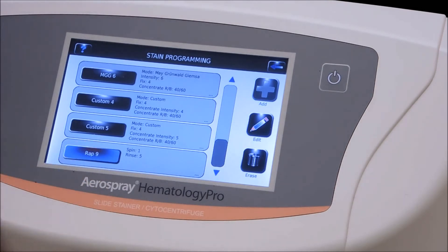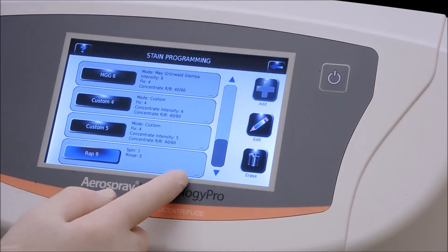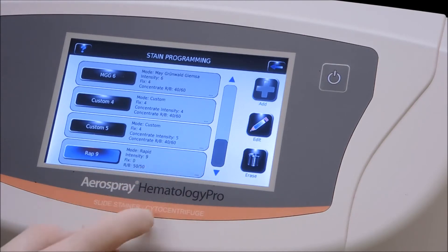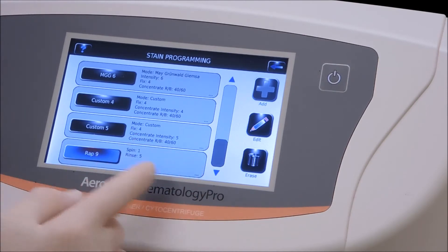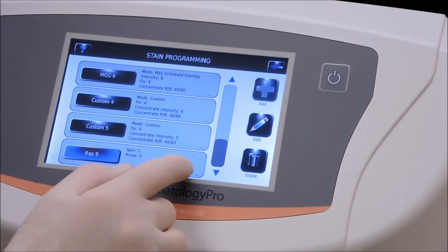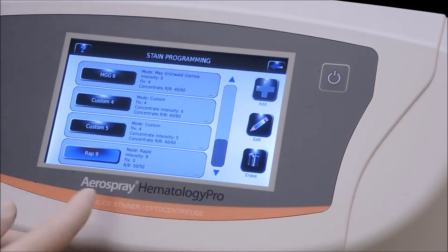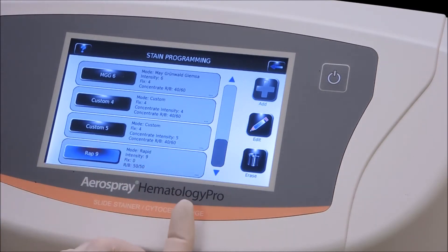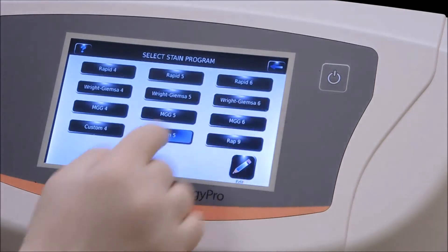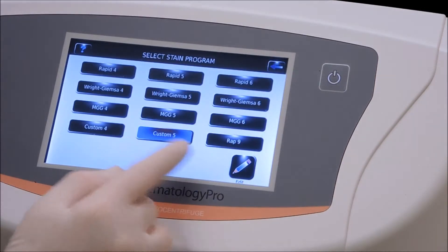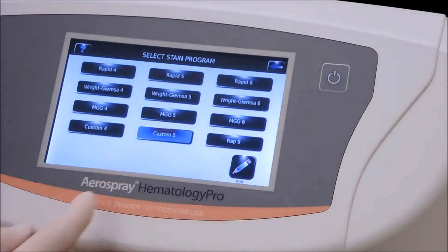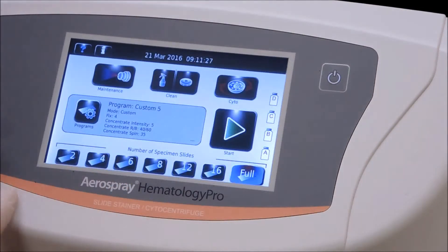Now we have the rapid number nine with the modifications we'd like, so push the save button. You can now see we have a rapid number nine mode with fixation at zero, the 50/50 ratio, spin one, and rinse five. These three buttons in the corner will toggle you back and forth from the beginning so you can see what the program is.